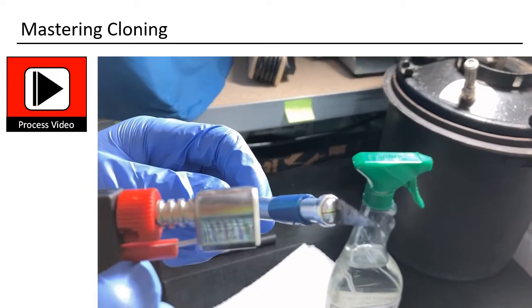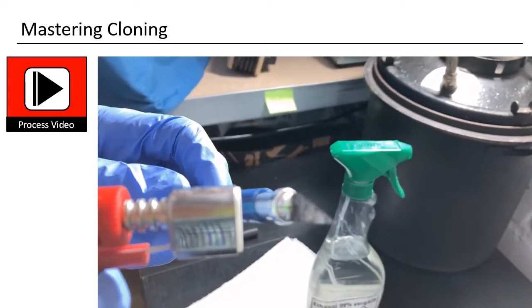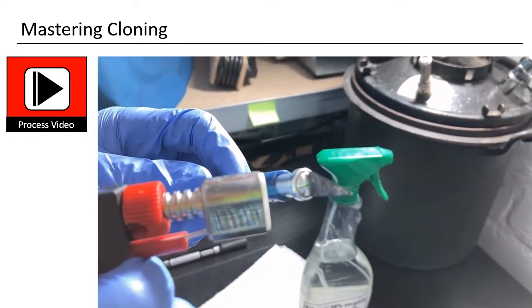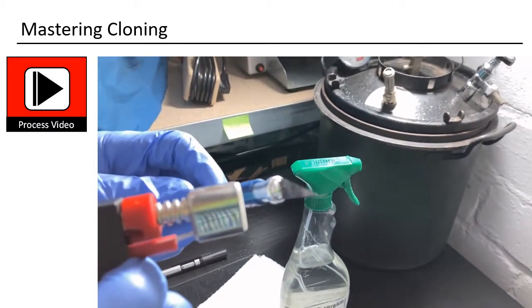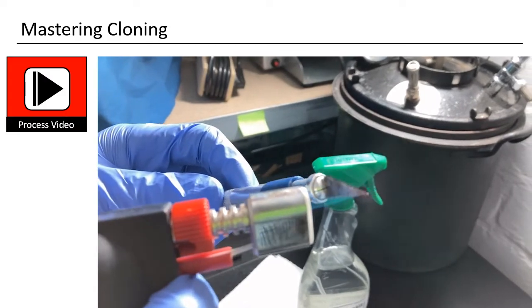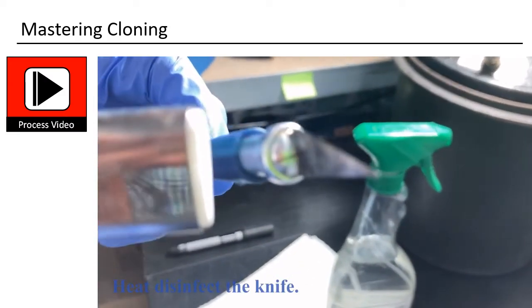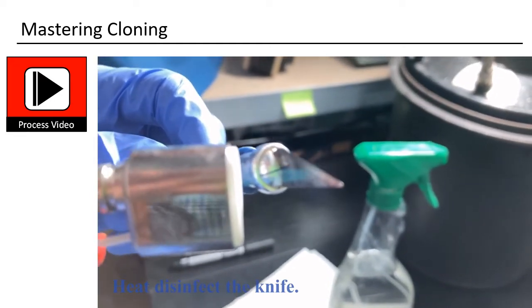Sterilize the knife. Be careful of fire hazard. Ethanol burns. Heat the knife up until it lights up red. This takes always some time. Do not be hasty. When the front part of the knife is red, you can cool it down with ethanol again.